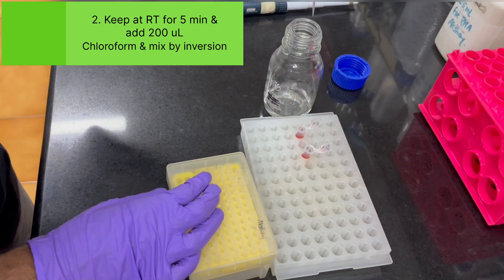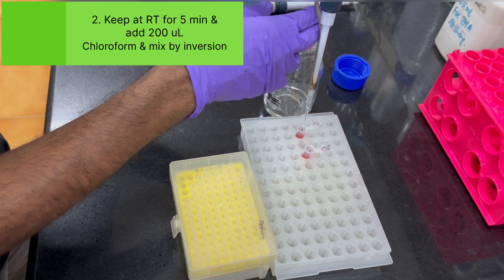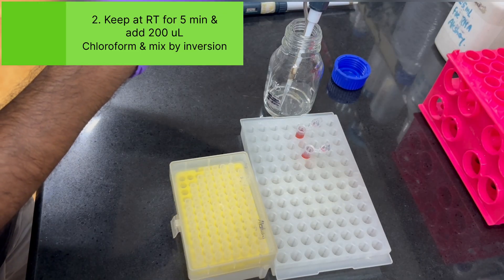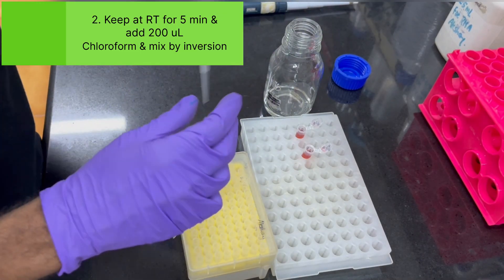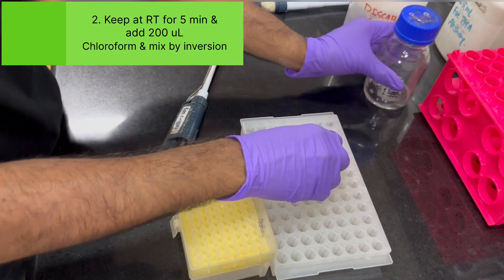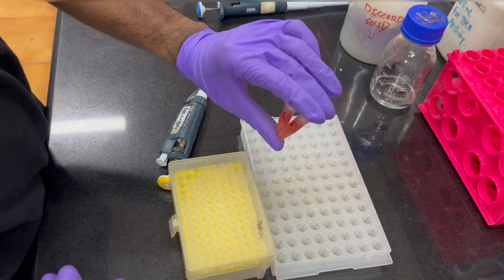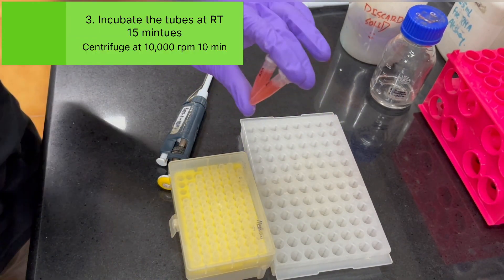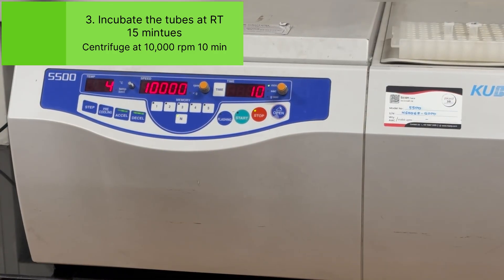After vortexing, keep it at 5 minutes at room temperature. Then add 200 microliter of chloroform into each tube. Make sure you are not touching the tube while adding the chloroform. And then close the tubes and do not vortex at this stage, just invert the tubes and keep it at room temperature for at least 10 to 15 minutes. Now centrifuge at 10,000 rpm for 10 minutes at 4 degrees Celsius. Then you will get three different layers.